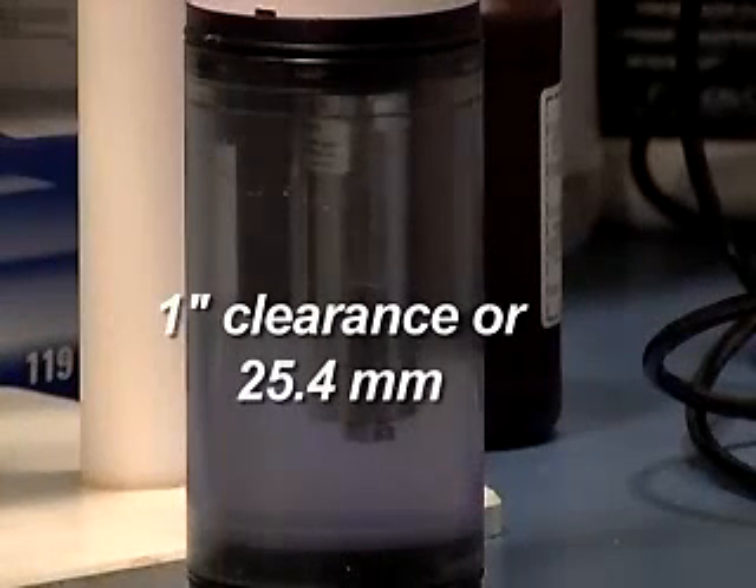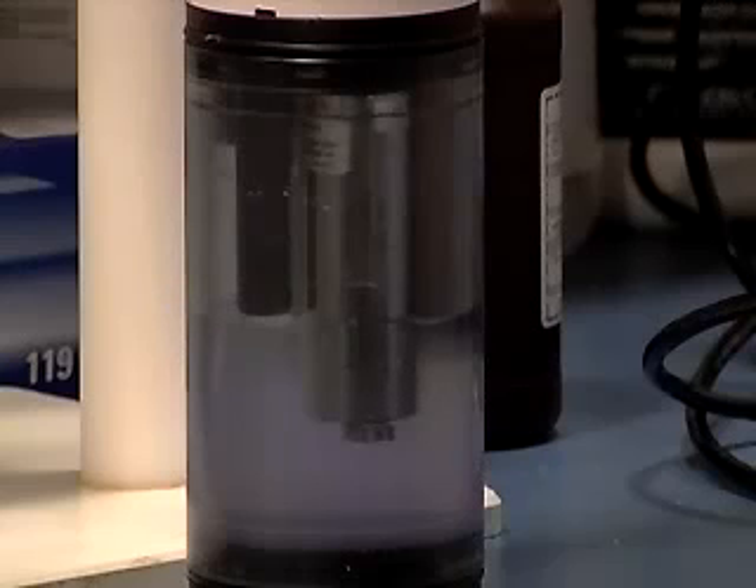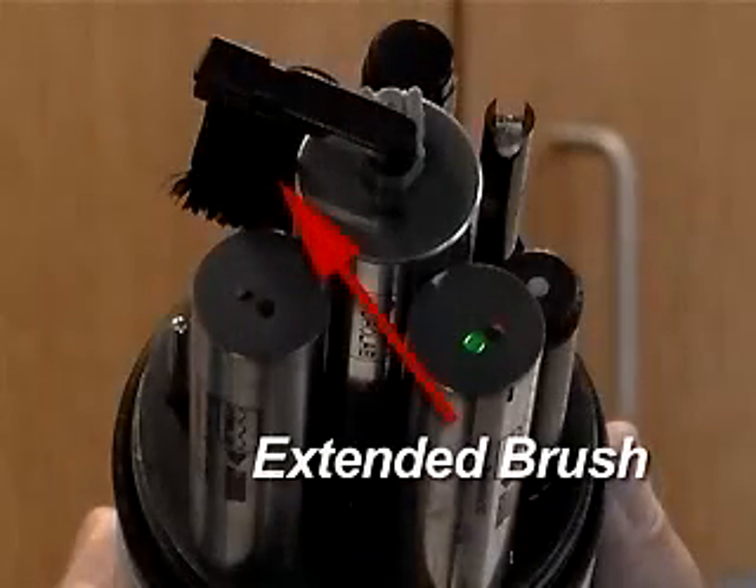To keep the optics clean, there is a motorized pad that can be set to wipe from one to nine times before taking a measurement, depending on the degree of sensor fouling expected. The X version also features an extended brush for removing debris from the other sensors.